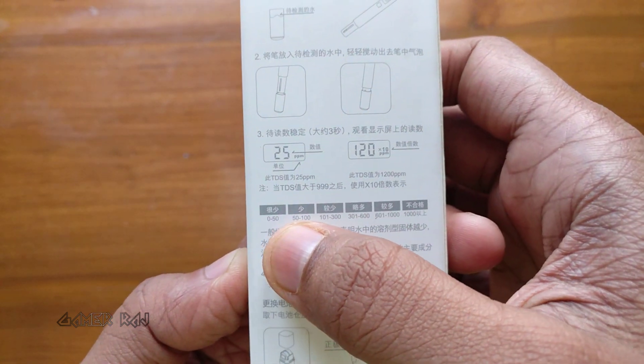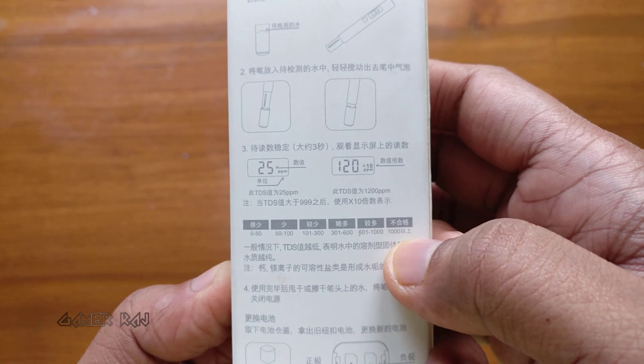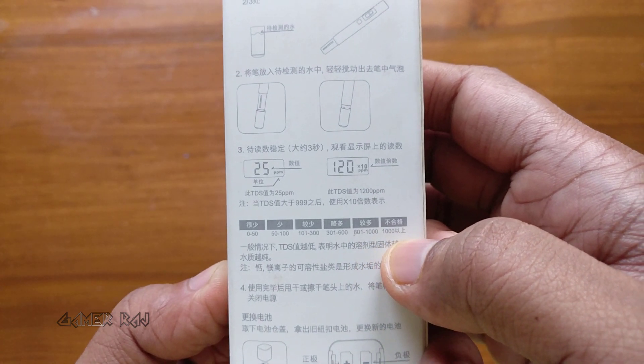These are the different ranges of purity: 0 to 50 is of high purity. More than 1000 is not fit to drink. The meter has a range of 0 to 9990 ppm.